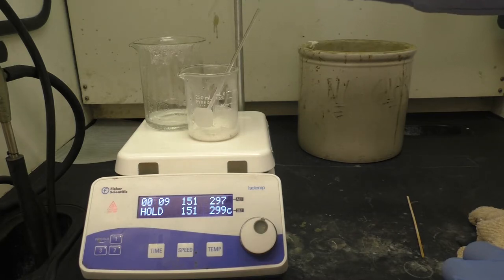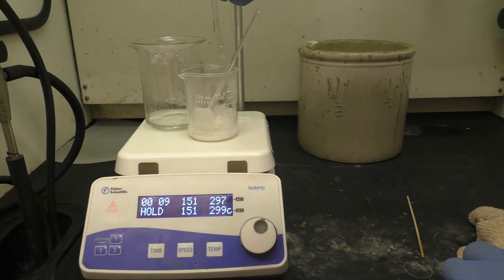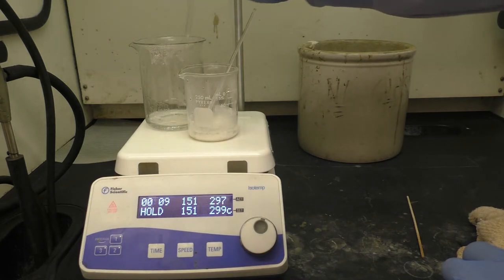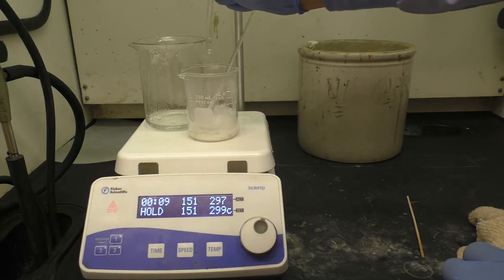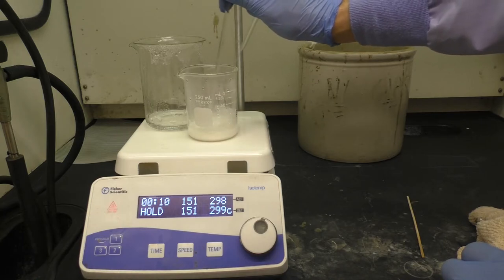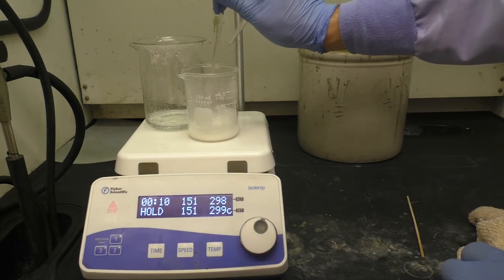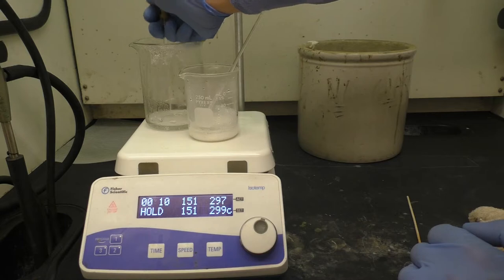I'll keep adding until at least I've got most of the material off the sidewalls, and it feels like I've got a decent amount of water in there. I obviously don't want to use too much, but I need to have enough to dissolve the material. Now, I'm just going to let this solution actually boil. As it begins to boil, you'll notice the solid begin to dissolve, and I'll just have to add enough water here to allow that to occur.